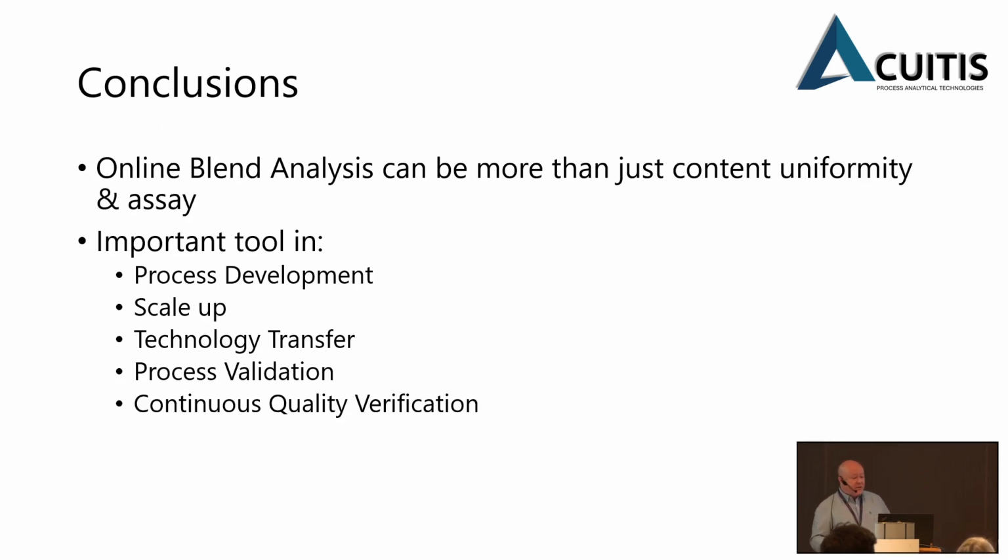So just in conclusion, online blend analysis can be more than just about content uniformity. It can be an extremely useful diagnostic and development tool for use in development. Really important in scale-up, tech transfer, and process validation, and as a tool for continuous quality verification as well.